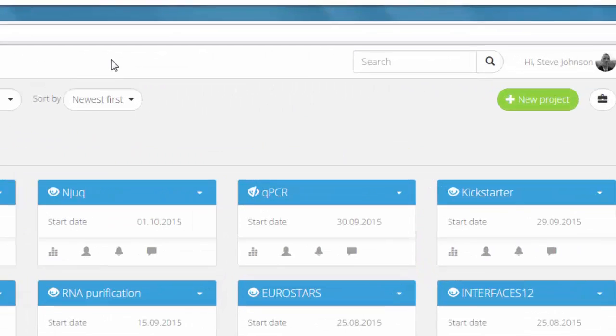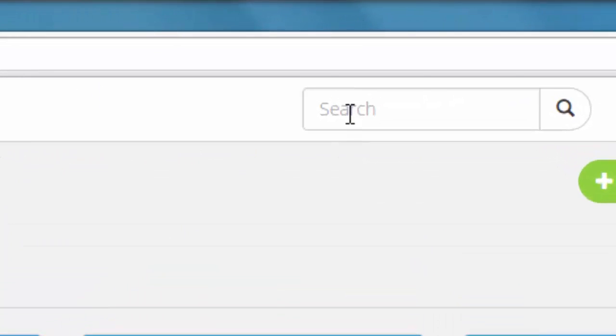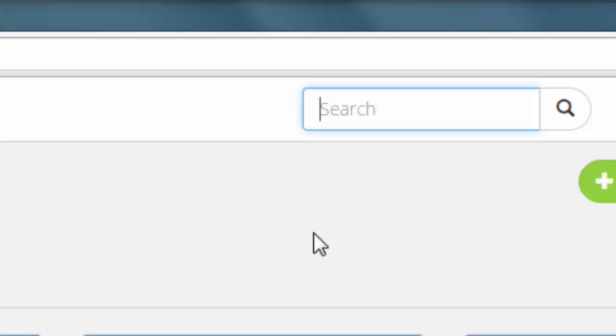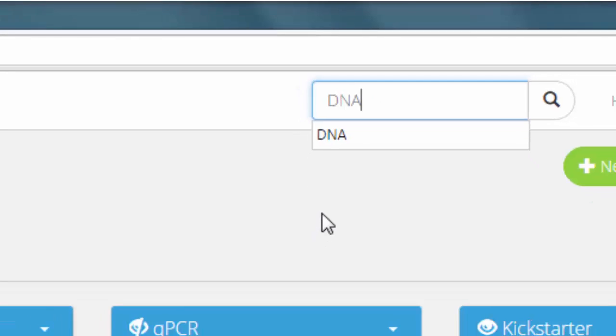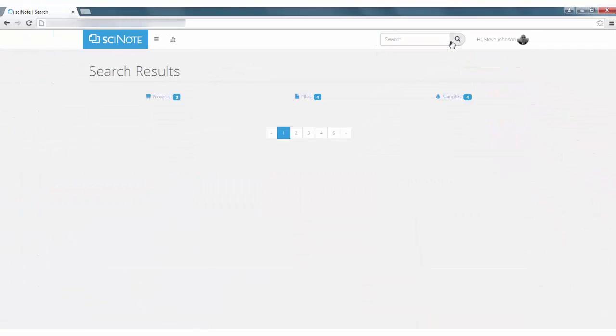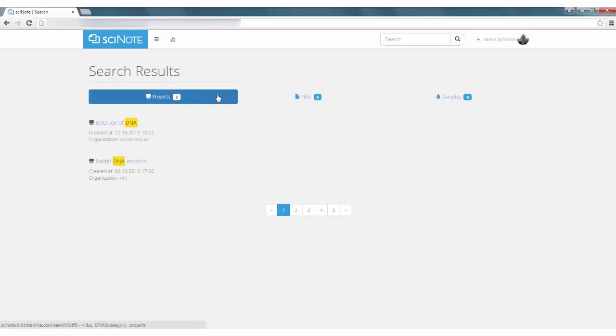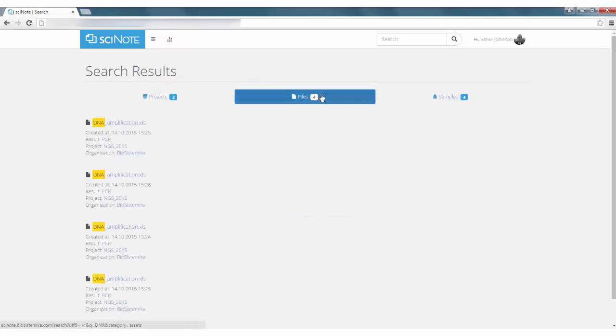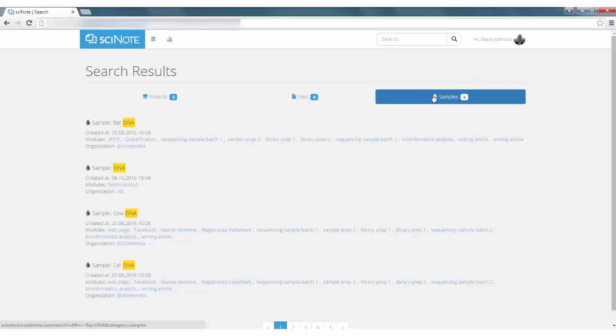SciNote has a powerful keyword search function that searches through all of your projects, including contents of the attached files. With SciNote search, you will instantly find the data you need.